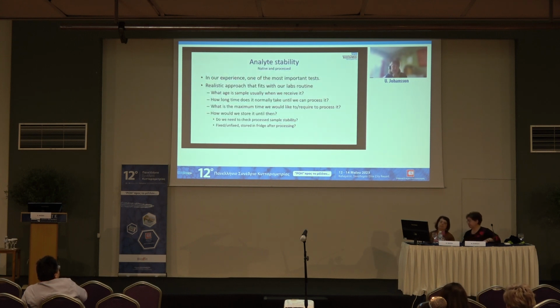Analyte stability. Well, both of the native sample and also of processed sample. And just like I said about the gating strategy before, I find that of all things that can go wrong at the end of the day, when we have different results, it's usually the analysis side of it, the gating strategy.